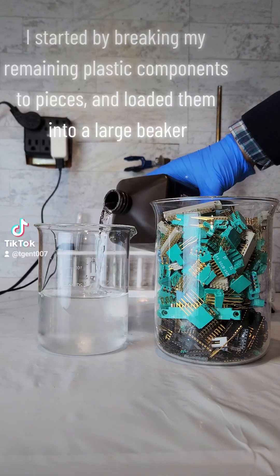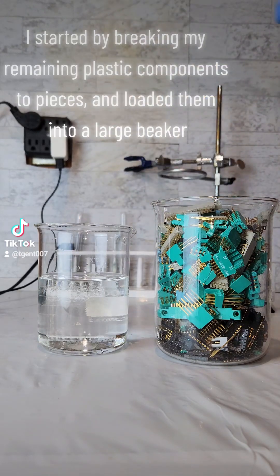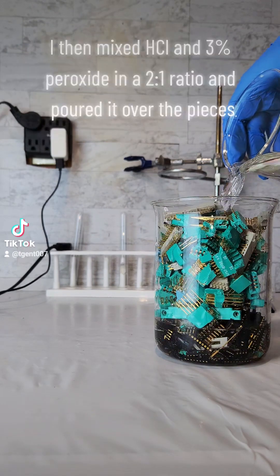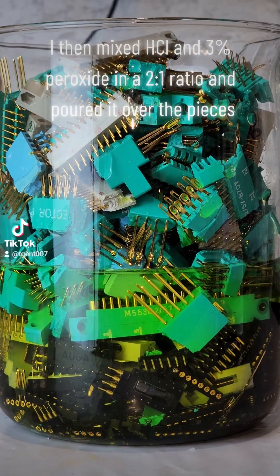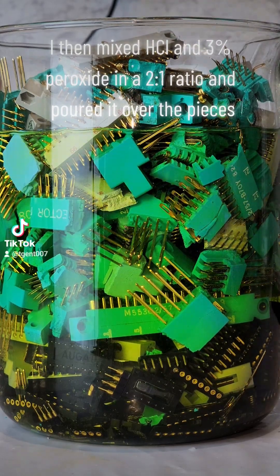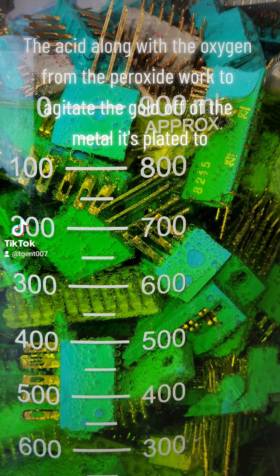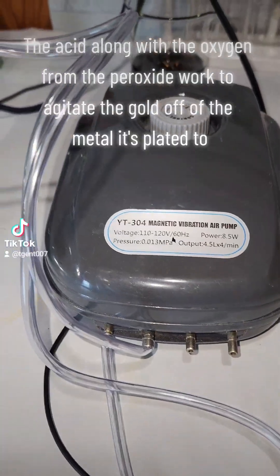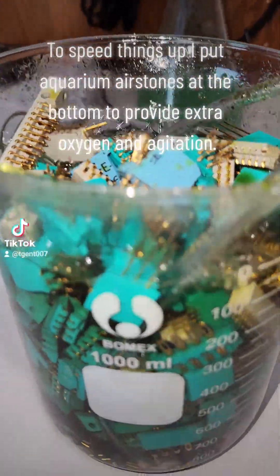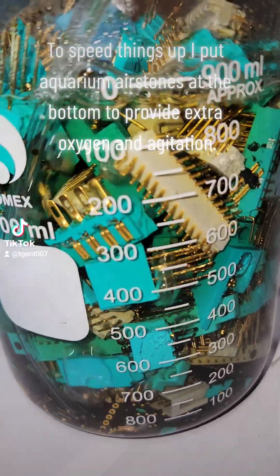I started by breaking my remaining plastic components to pieces and loaded them into a large beaker. I then mixed HCl and 3% peroxide in a 2 to 1 ratio and poured it over the pieces. The acid along with the oxygen from the peroxide worked to agitate the gold off of the metal it's plated to. To speed things up, I put aquarium air stones at the bottom to provide extra oxygen and agitation.